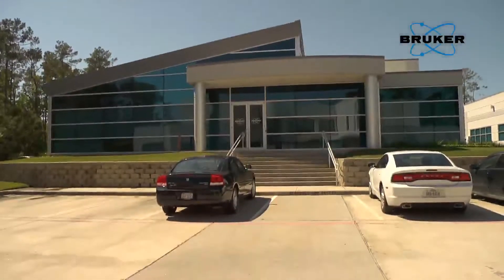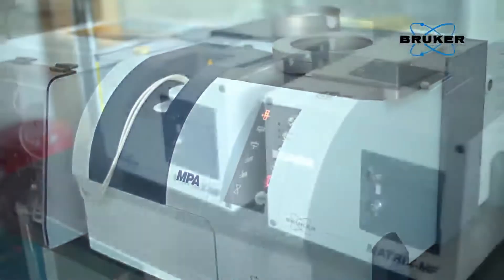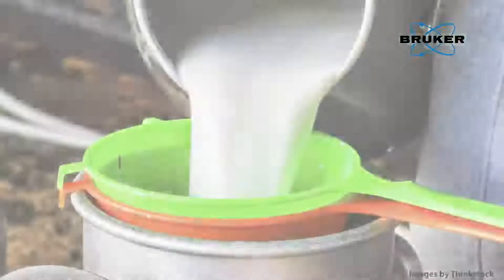Bruker's FT-NIR product line includes the Tango, the MPA, and Matrix-I spectrometers for lab and at-line applications, as well as the Matrix-F series for process control.